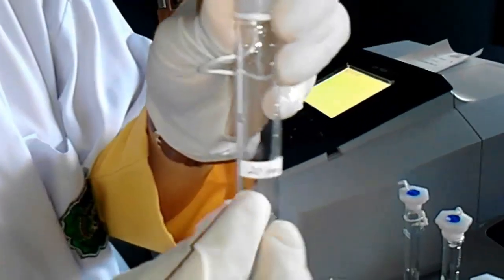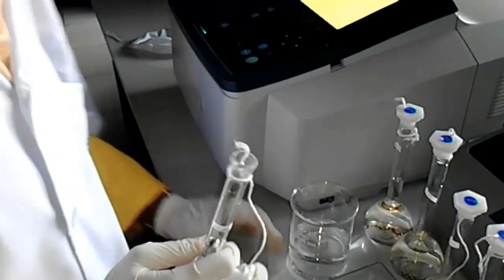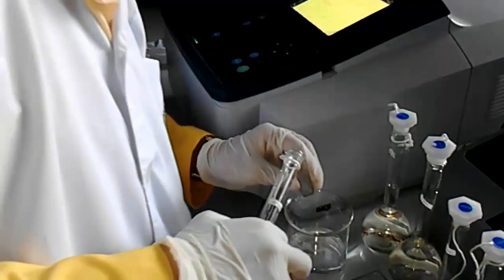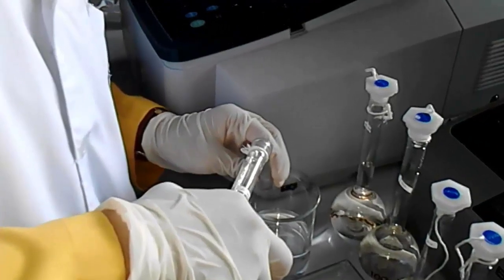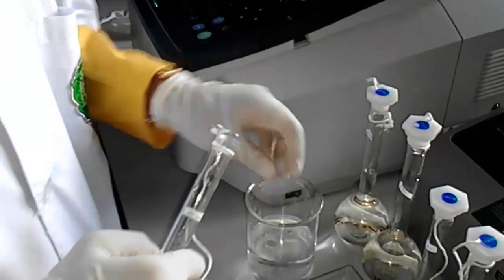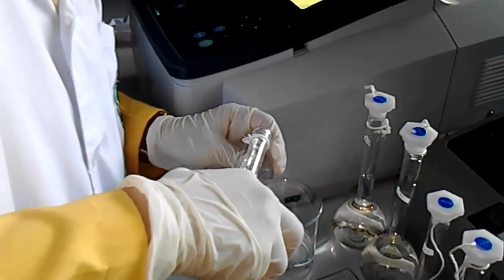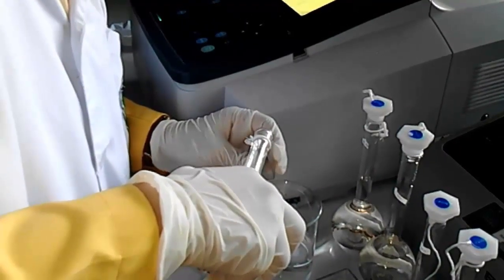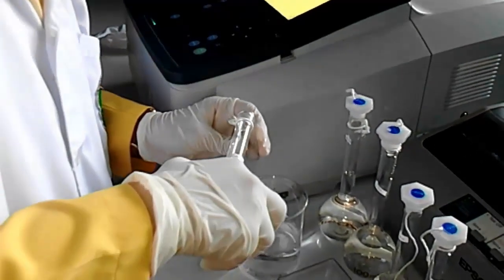And this is the 20 ppm standard of chloramphenicol. Wash off the cuvette with 20 ppm standard of chloramphenicol. Then pour it in the cuvette.